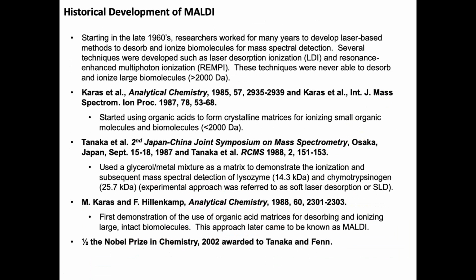MALDI is not as commonly used in glycan analysis, although I'll talk about some examples. What it's really used for in, say, the pharmaceutical industry is tissue analysis, as I mentioned. If you're looking for where your small molecule is in liver tissue, you take a mouse or a rat, and you cryotome it all the way down, you can actually put an entire thin slice, 10 micron, whatever, 50 micron slice of a rat that's been dosed with your drug of interest, cover it with matrix, put it into the mass spec, and you can image it. Come back the next day and check it all out and see where everything is.